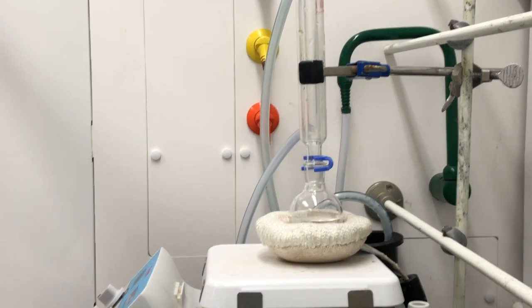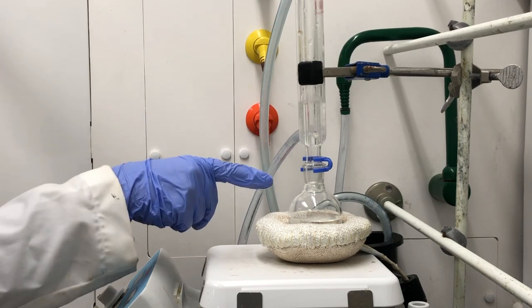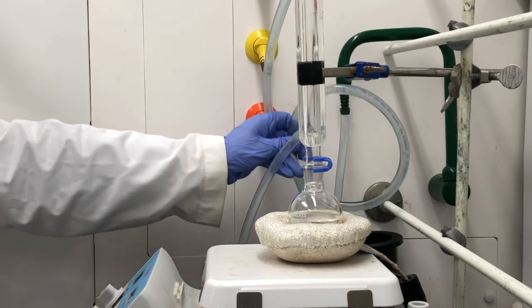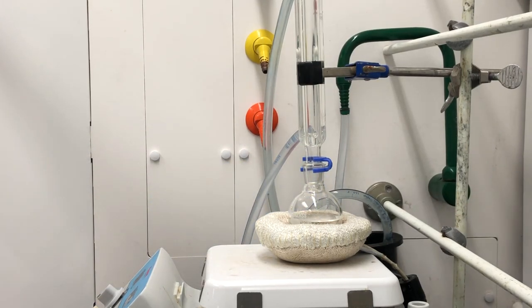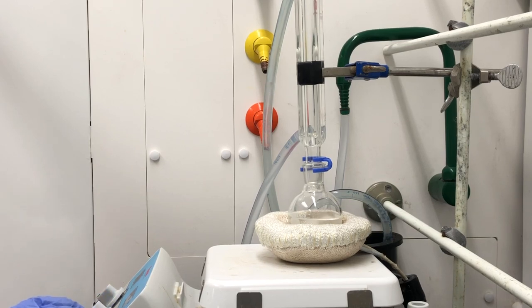I'm going to turn on the switch for the green knob, which controls the water flow. You should see the water flowing — you want a steady flow of water, and it's draining right here into the drain. Then we can go ahead and turn the power on for the heating mantle and turn on the stir bar.